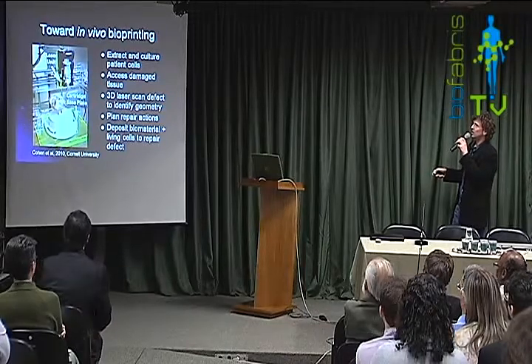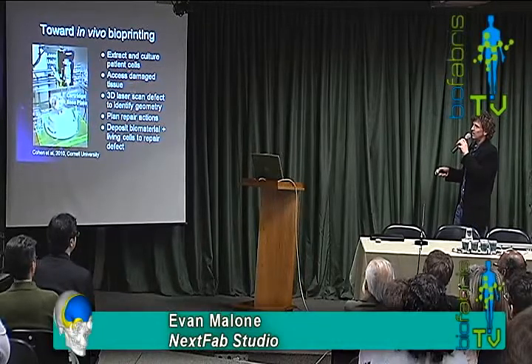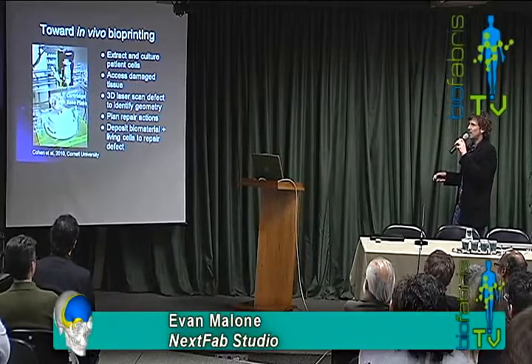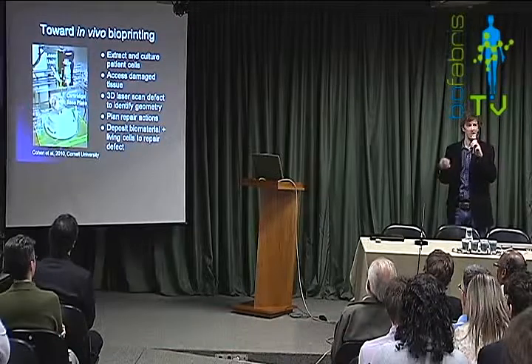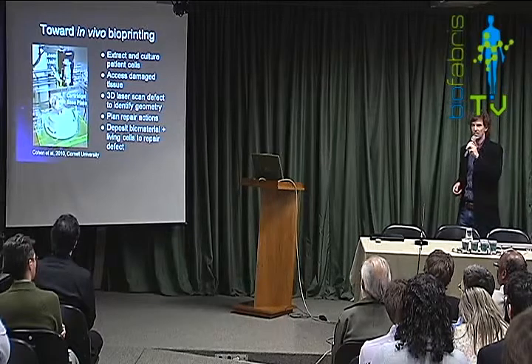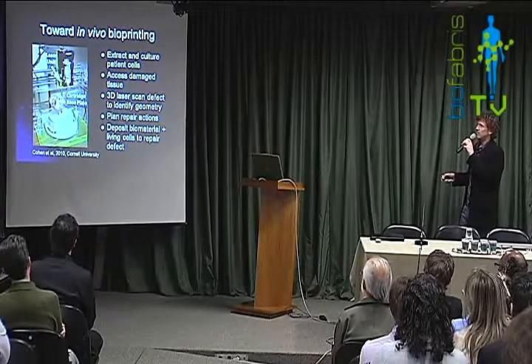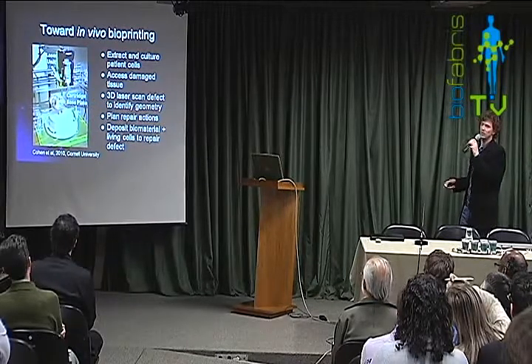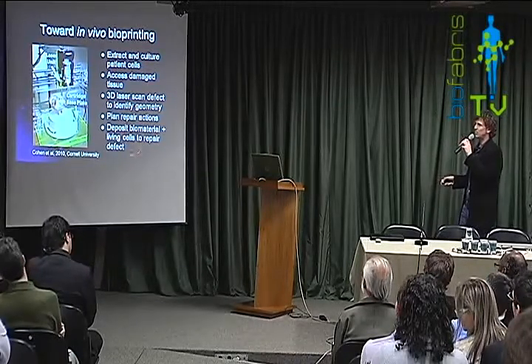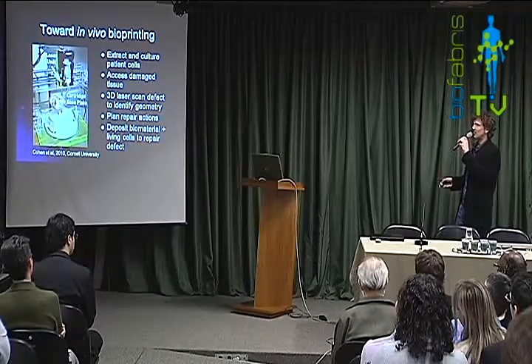And the idea here is to extract and culture cells from the patient, create a portal through the body to access the damaged region, 3D laser scan the defect, use some kind of imaging technology to identify the geometry of the defect, and use maybe expert knowledge of the medical professionals to understand the cell types of the defect. And then with that geometry, plan repair actions, that is the shape that needs to be printed to fill up the gap, and then deposit biomaterial, living cells, maybe scaffolding, stiffener, that sort of thing in there to replicate or repair the defects.